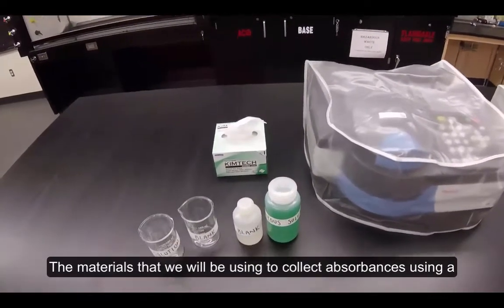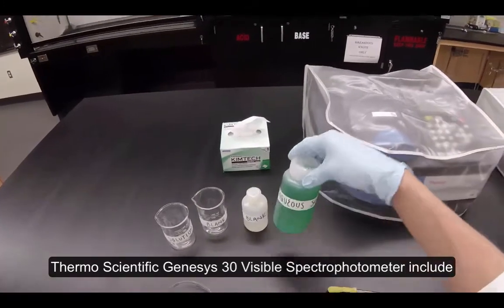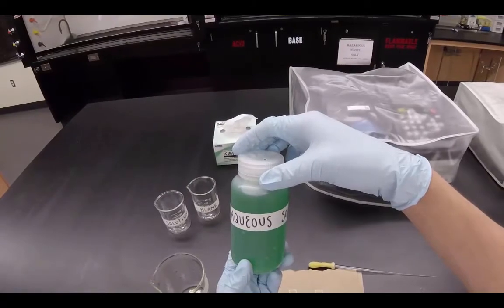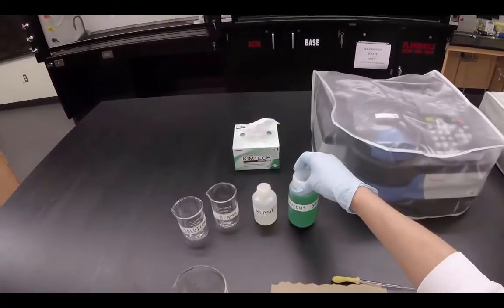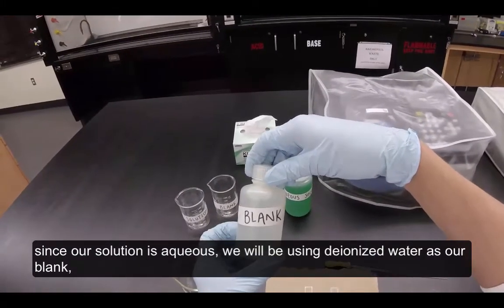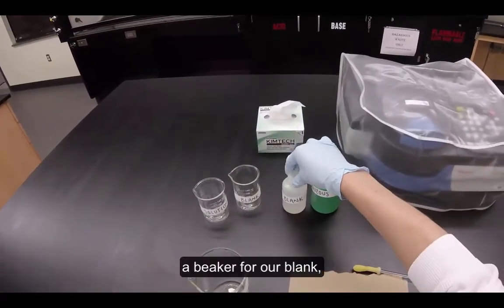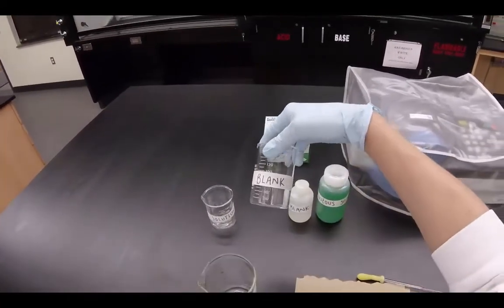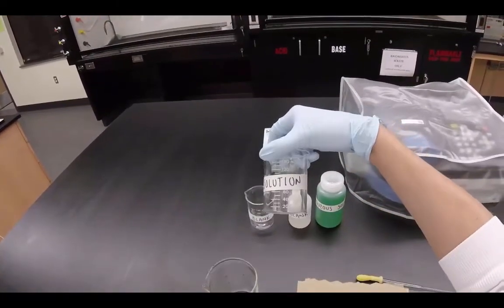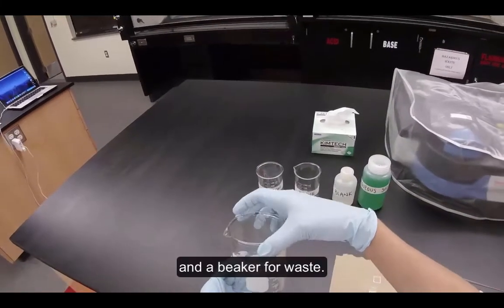The materials we will be using to collect absorbances using a Thermo Scientific Genesis 30 visible spectrophotometer include our solution, a blank for our solution. Since our solution is aqueous, we'll be using deionized water as our blank, a beaker for our blank, a beaker for our solution, and a beaker for waste.